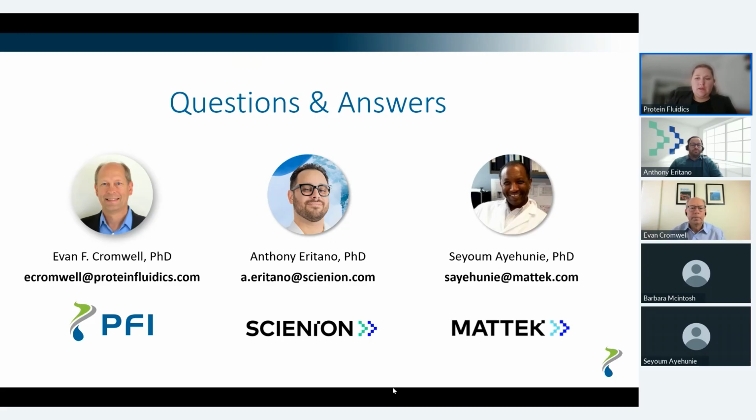Great. And then next is for Anthony. Can the spheroONE isolate IPS organoids?